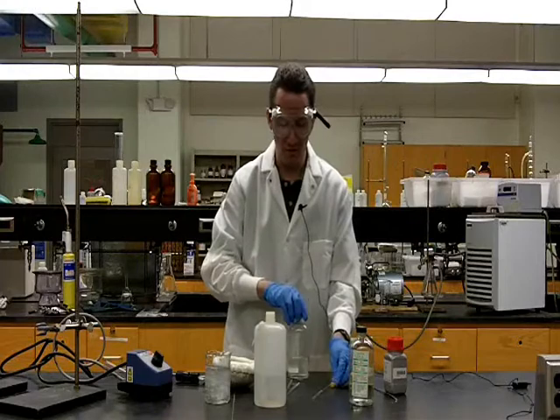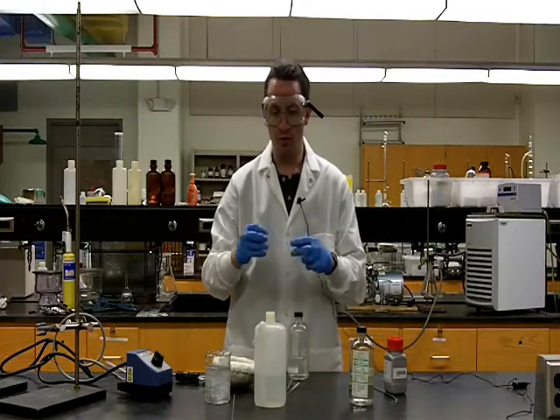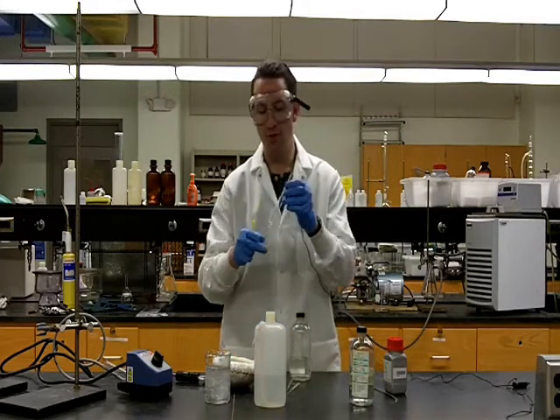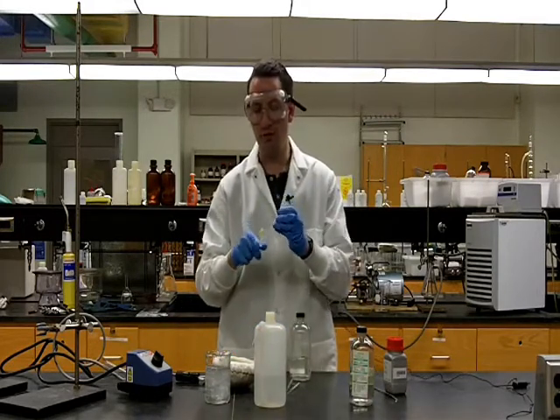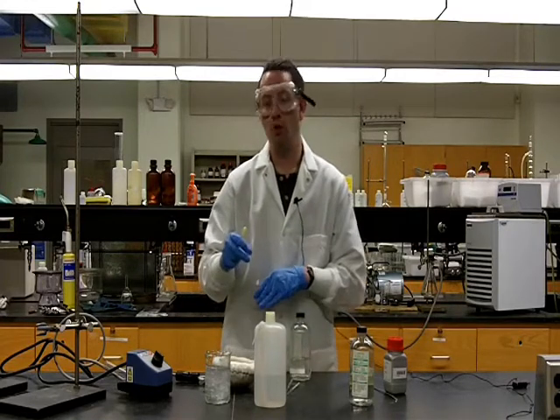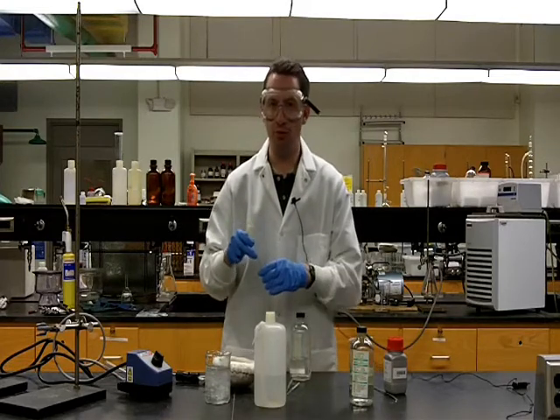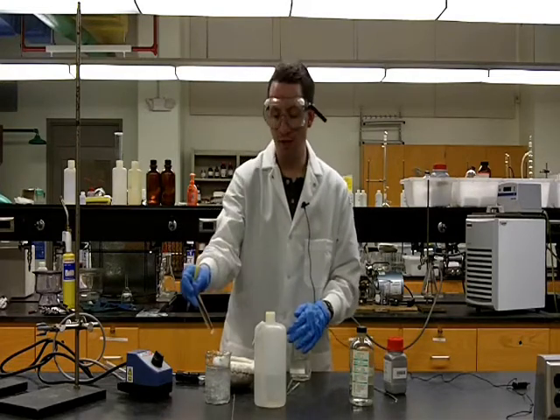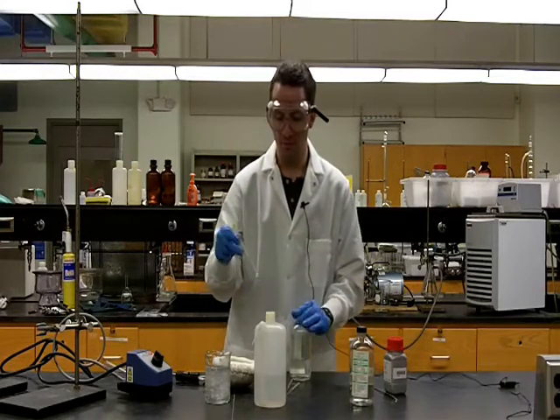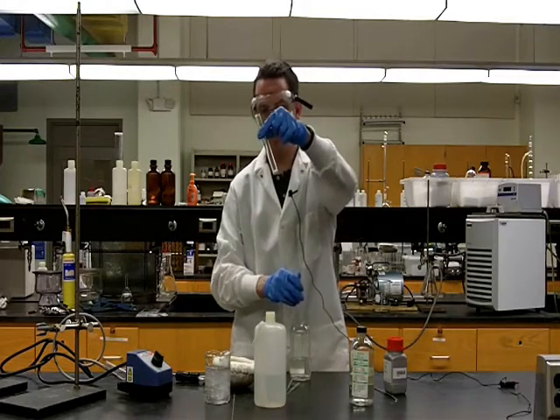So in our first trial, we will start by using toluene. Toluene, being an aromatic hydrocarbon, is a highly nonpolar solvent. So to my first test tube, I will add a small amount of toluene, and we'll see what happens at room temperature. If the fluorene is completely soluble at room temperature, then we know that it's a poor choice for solvents. If it's not completely soluble at room temperature, then I'll heat the sample up and see if it dissolves when it's hot.